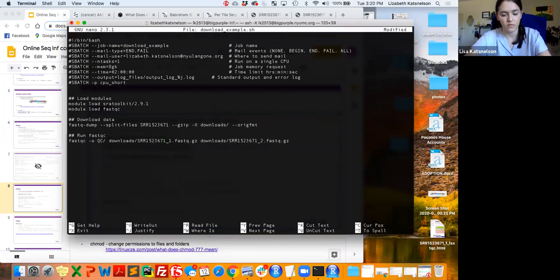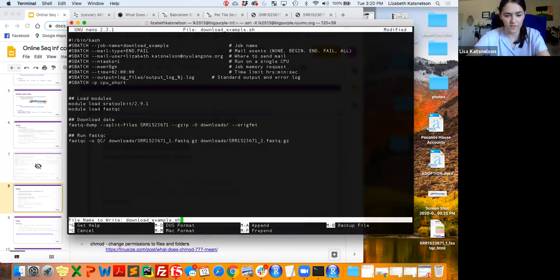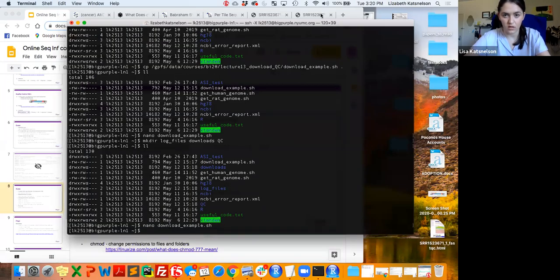So if we exit out of here, let me just check the chat. Okay, hopefully everyone is able to get this far.